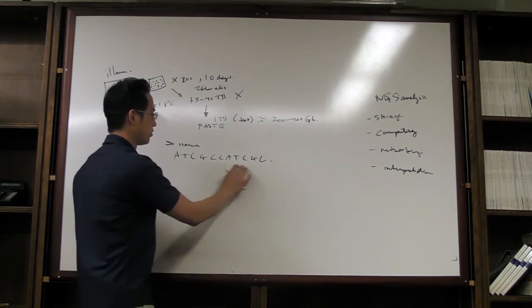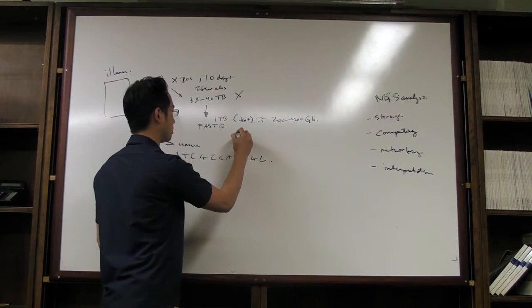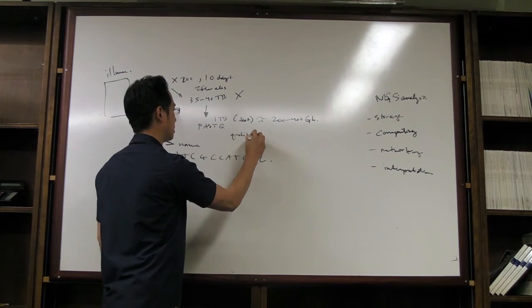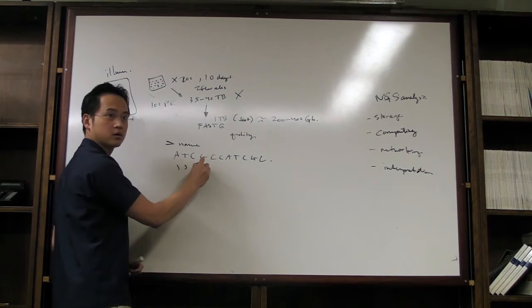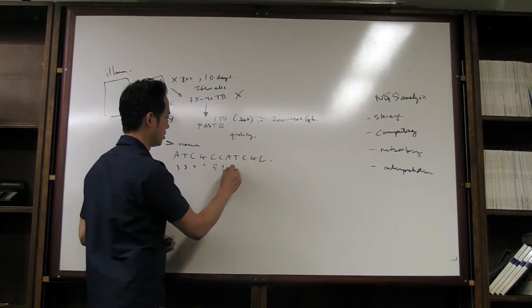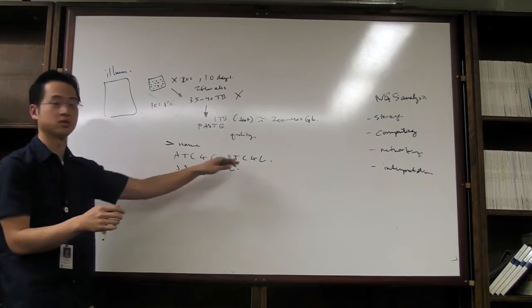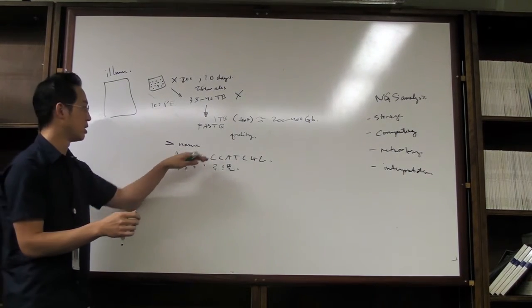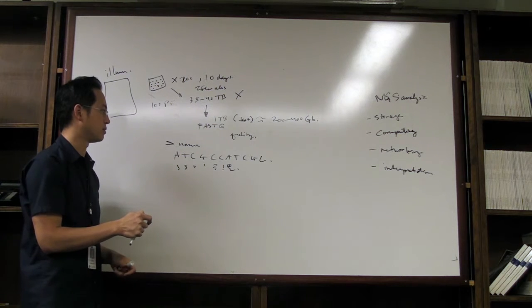It has the bases here, but included in here is a quality score. And I forget how it's encoded, but there are some weird characters in here. It might be a question mark, an exclamation point, an @ sign. But these are going to say what the quality of each of these bases is. And that's what is added on top of the FASTA format.